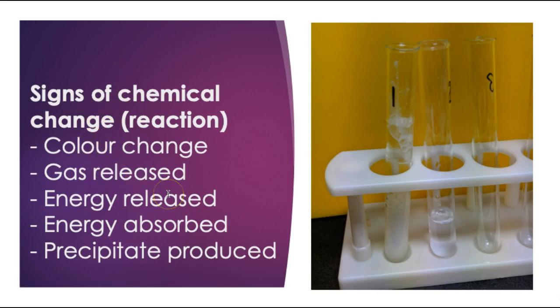Gas released, i.e. bubbling. Energy released, it gets warmer. Energy absorbed, it gets colder. Or a precipitate produced, so you've produced a solid where you didn't have a solid before. Any of those are signs of a chemical reaction. Make sure you note that down on your observation sheet.